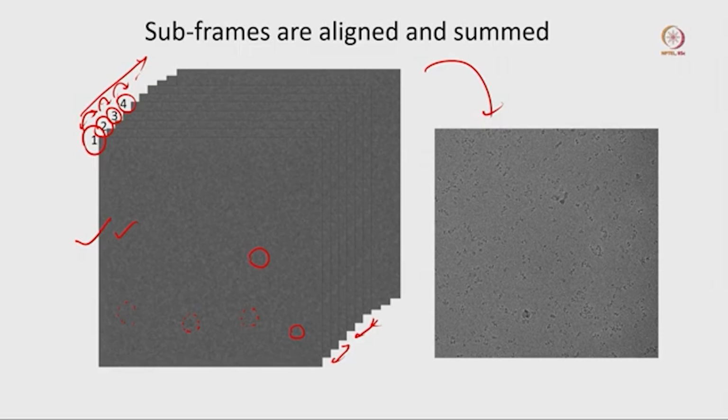but when we integrated and corrected the motion, you can see a very clear pattern, where you have some small protein molecules. Those black molecules are the protein molecules, and this is a cryo image. As I mentioned previously, in the cryo image, protein appears black on a comparatively white background. So these are our proteins. This is how we align the images, and it helps us correct the drift.